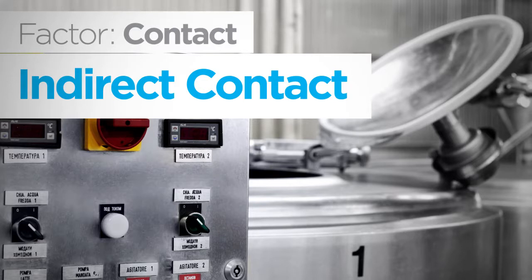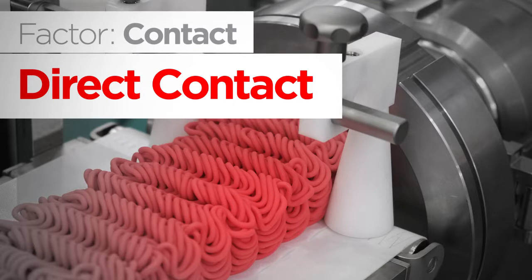The next factor is direct contact versus indirect contact surfaces. Surfaces that do not have direct contact with high-risk products, such as a control button or the side of a conveyor belt, may allow less stringent RLU limits. On the other hand, surfaces that do have contact with high-risk products, such as raw meat, may require stricter RLU limits to ensure cleaning interventions are effective.